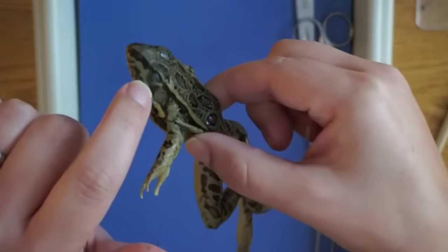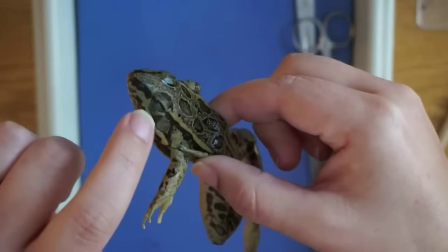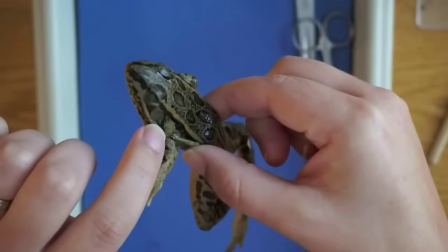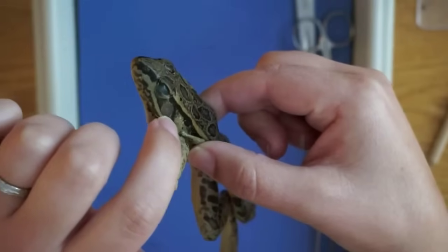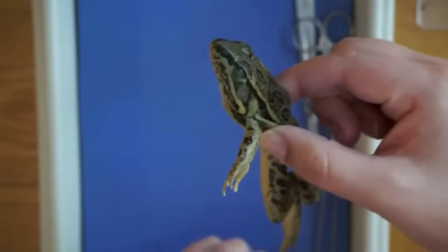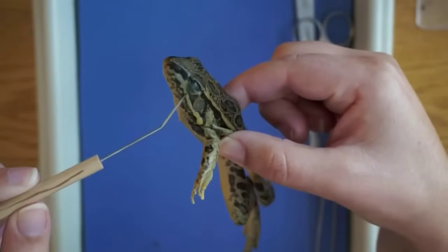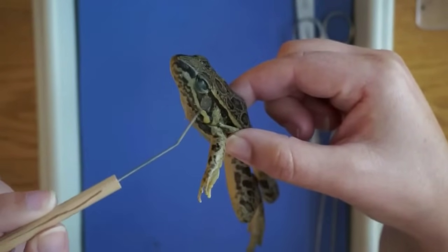On the head, there's a nictitating membrane over the eye to protect the eye. And then behind that is a tympanic membrane, which functions as the frog's eardrum. So again: nictitating membrane and then tympanic membrane.